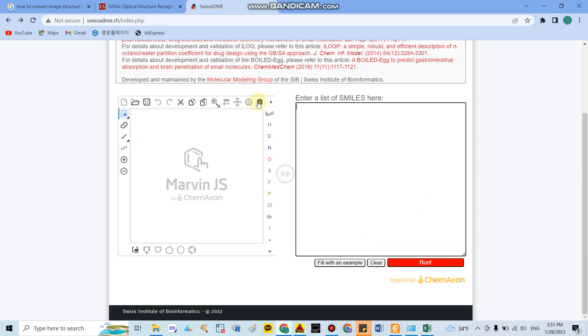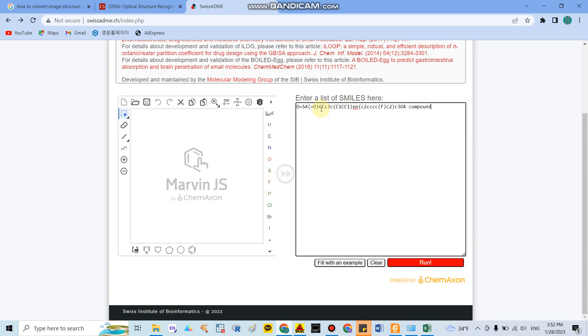I will also describe the link of this website in my comment. In here you can enter the image and you set the name of the compound as compound number one, and after that you can run.